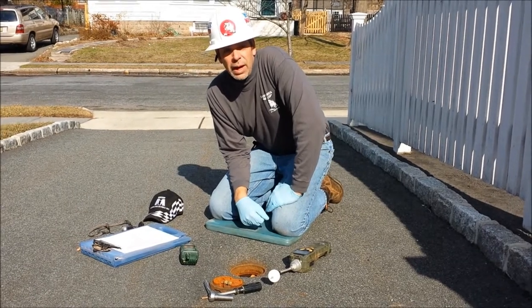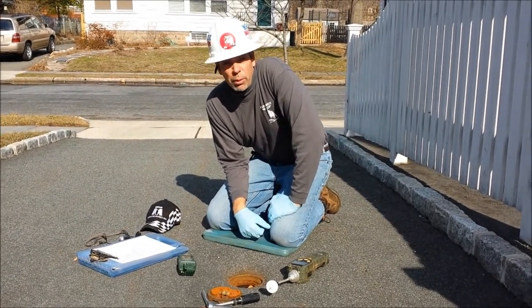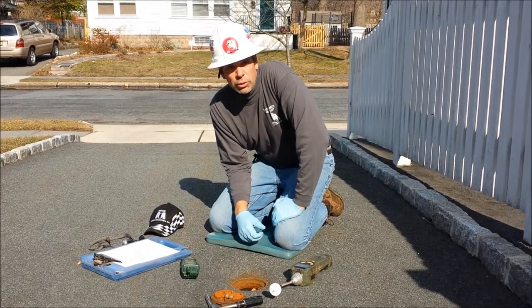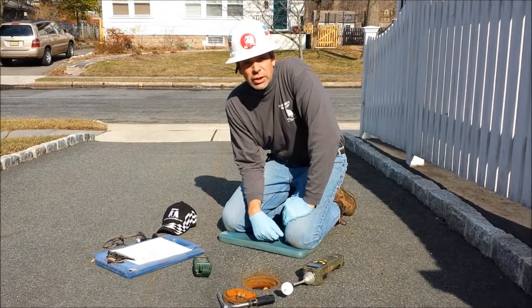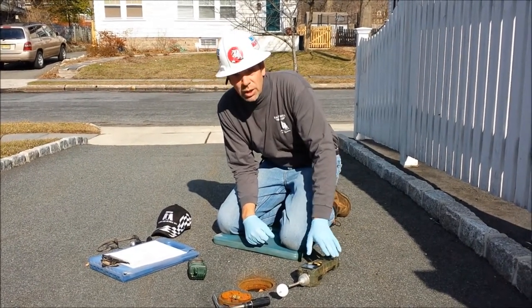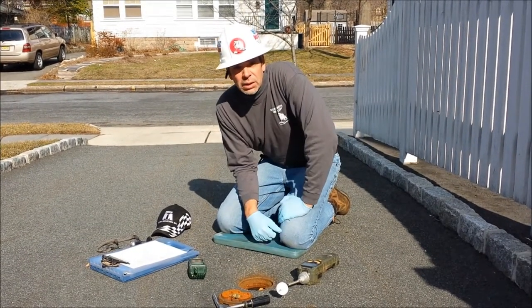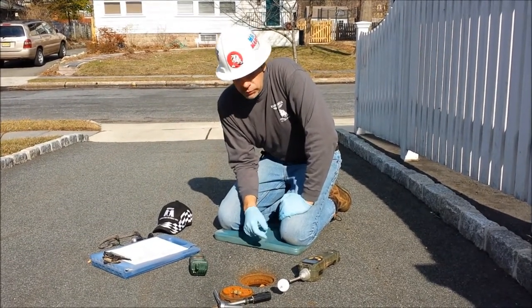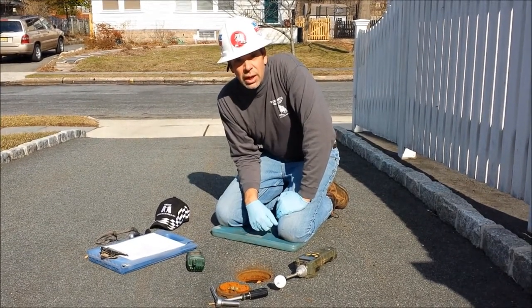So we're at our first monitoring well. What we're doing is compliance groundwater sampling under a New Jersey Department of Environmental Protection permit by rule. Before we even take any water out of this well, there's a whole bunch of things we have to do first. The DEP wants to see if there are any volatile organics in the well that might be coming up into the atmosphere upon opening the well. So we're going to do that first, then we're going to check for CO2 levels, and then we'll continue on.